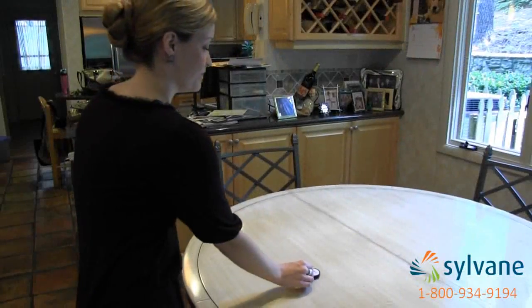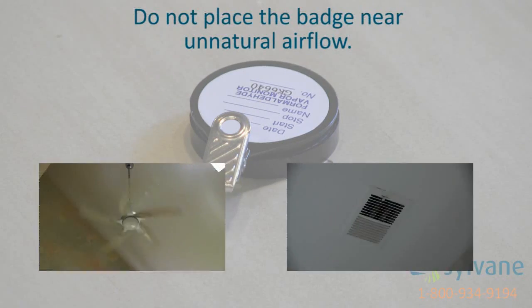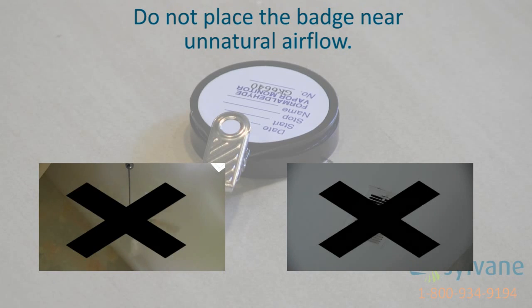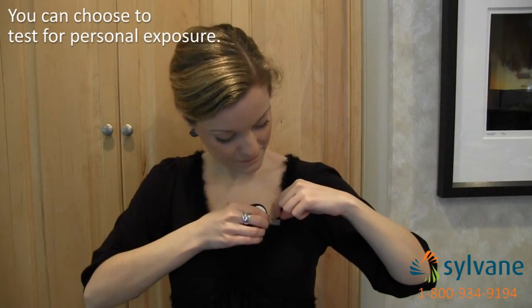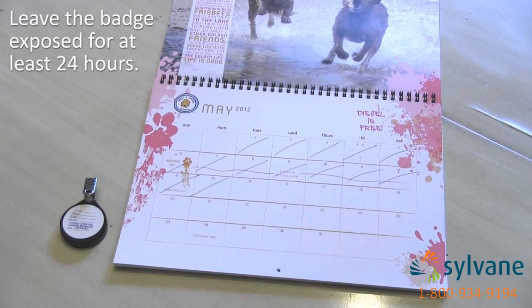Place the badge in a room you'd like to test for formaldehyde. Choose a surface away from sources of unnatural airflow, like ceiling fans or AC vents. To test personal exposure, clip the badge to the front of your shirt. Record the start time on the chain of custody form and leave the badge exposed for 24 hours.